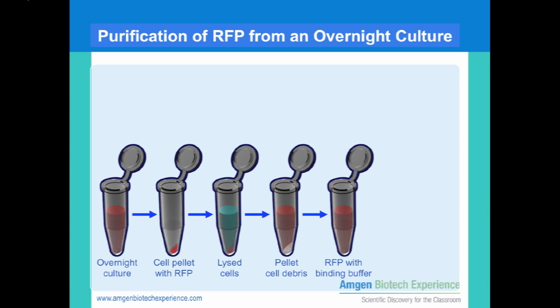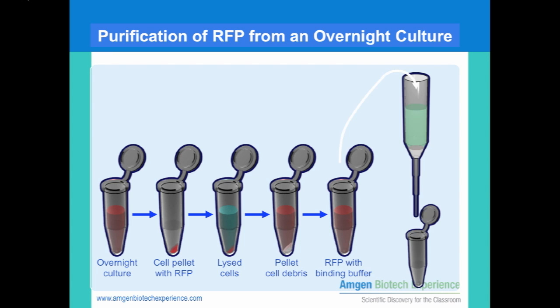Transfer the pink liquid supernatant into a new microfuge tube and add binding buffer. This will be the protein mixture that you will separate by hydrophobic column chromatography so that you will end up with purified red fluorescent protein.